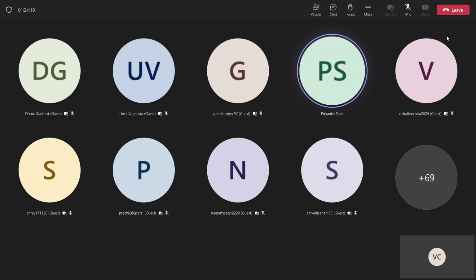Today we have seen 3 practicals: zinc, calcium, lead, magnesium, and iron, chromium, right? Zinc, calcium, and lead, magnesium, these both are direct titrations, while this one is kinetic masking. Iron, chromium is kinetic masking and also back titration, right? Okay, so who will make them? Tell me.